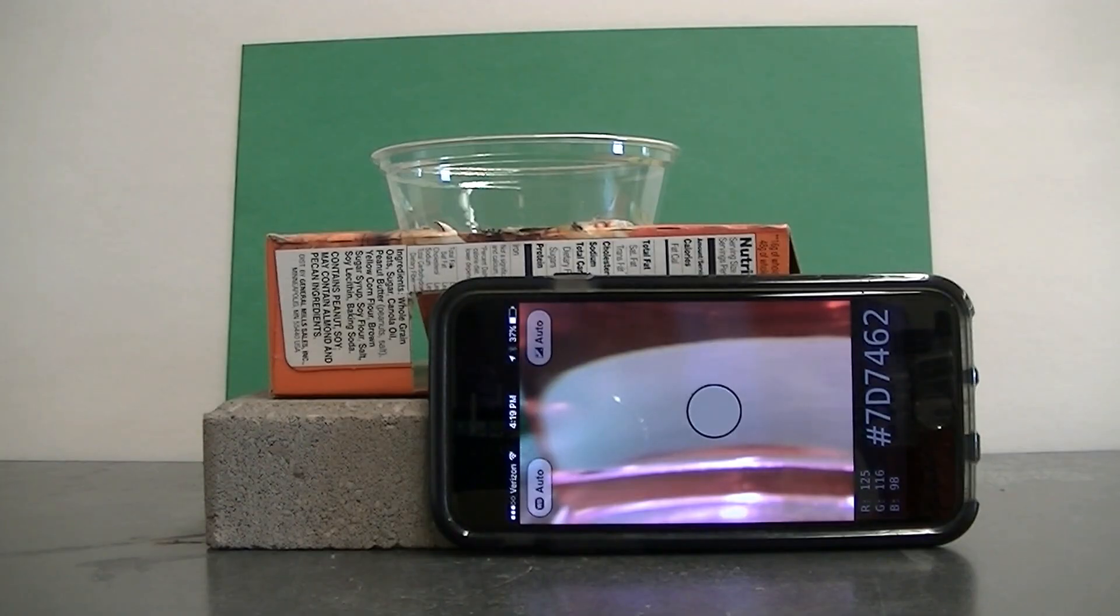In this video I'd like to show you how you can use simple materials and a smartphone to teach about spectrophotometry and Beer's Law.